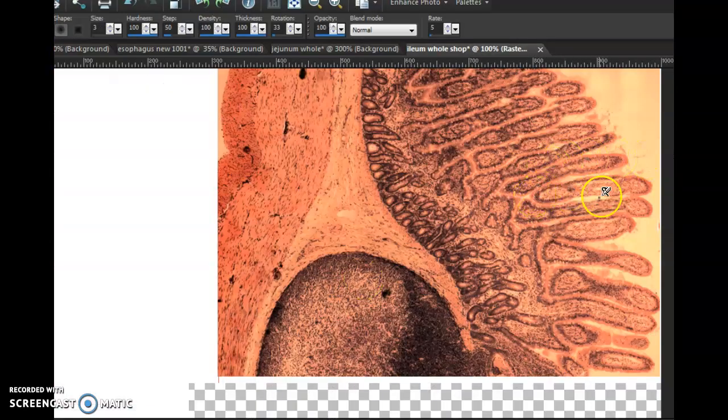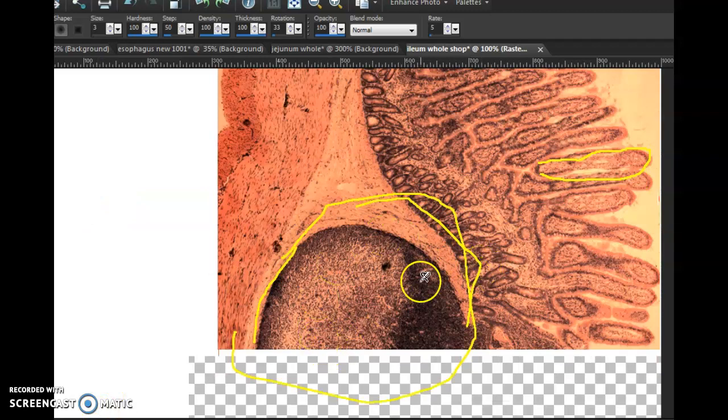So this is our ileum slide. It still has villi. They're shorter and stubbier. You're not getting much absorption of carbohydrates, lipids, and proteins here. You're getting some mineral absorption still. So it does have villi. And we have these awesome structures called Peyer's patches. So this is what the Peyer's patch looks like on the histology slide for the small intestine.